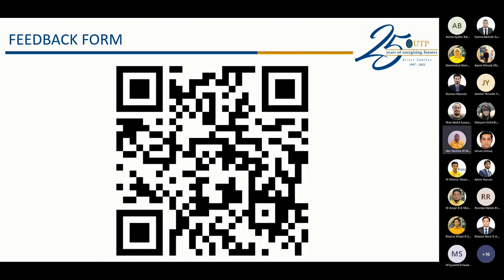Yes, that is correct. The particle size basically consists of several crystallites. If your sample is semi-crystalline, it has a crystalline part and also an amorphous part. So when you measure the particle size from SEM or TEM, you measure the distance comprising the crystal and also the amorphous part. Can we say that a smaller particle size will give us a better XRD peak?